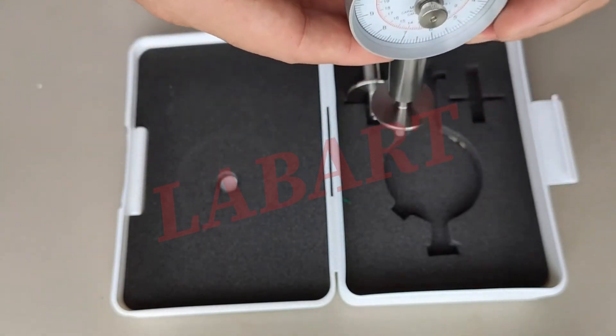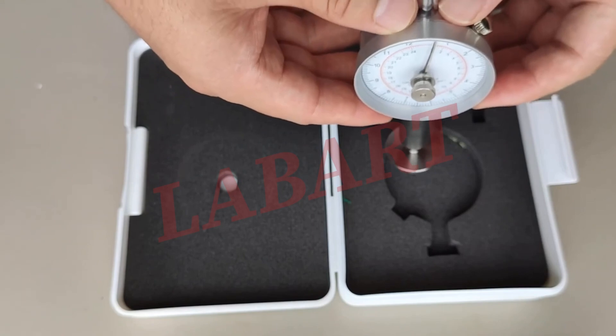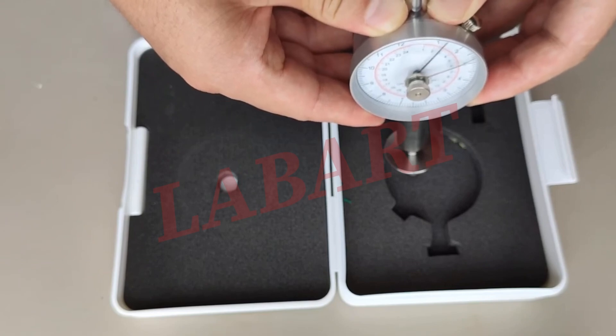So, when we have a fruit, we just push — push until the designated position. Then we stop.